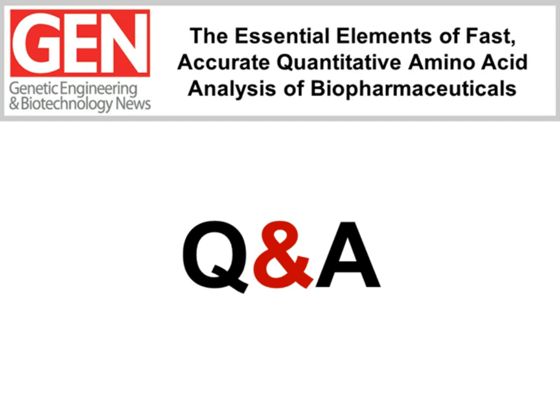The amount of variability depends on the amino acids and how well you control for destruction during hydrolysis. The general perception that you would find in ABRF studies is that for a comparison to a true value, you can expect to be within 5 or 10% of the true value, and we certainly get better results than that. Hope that answers your question.